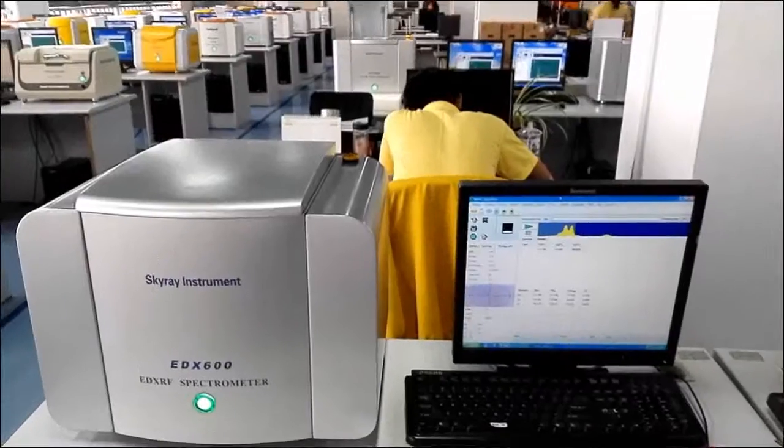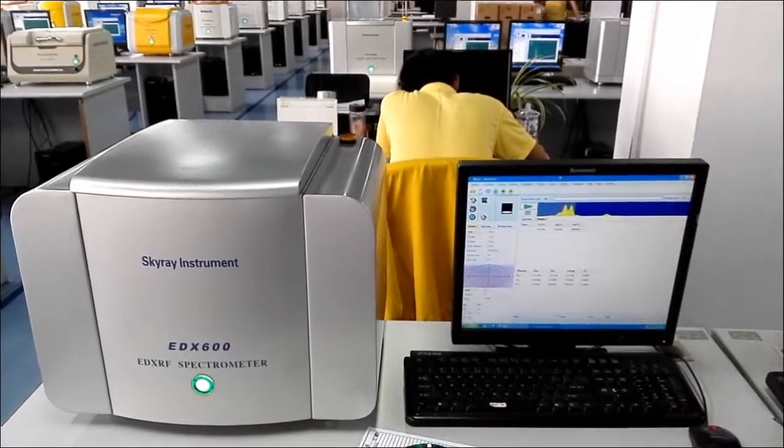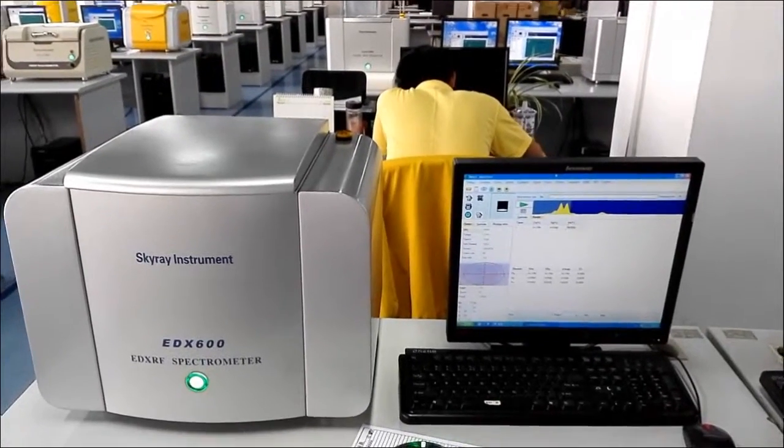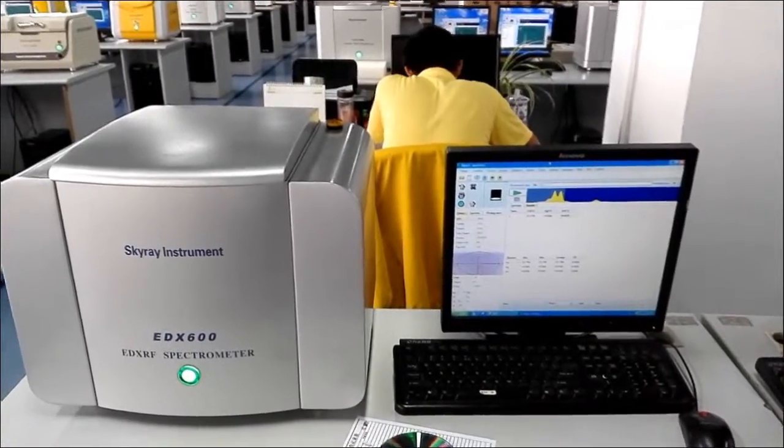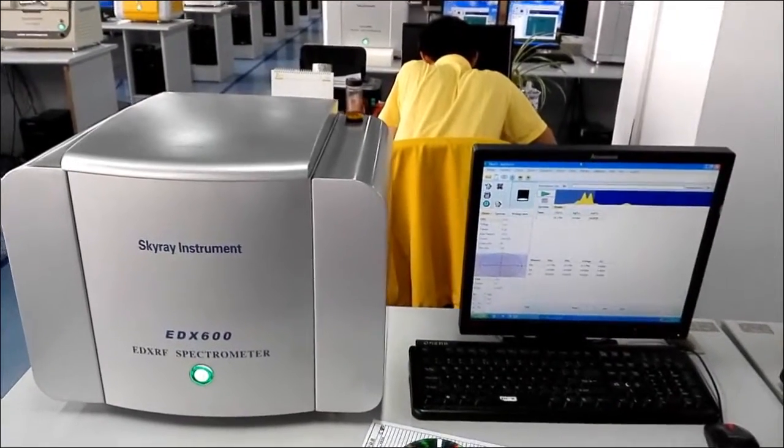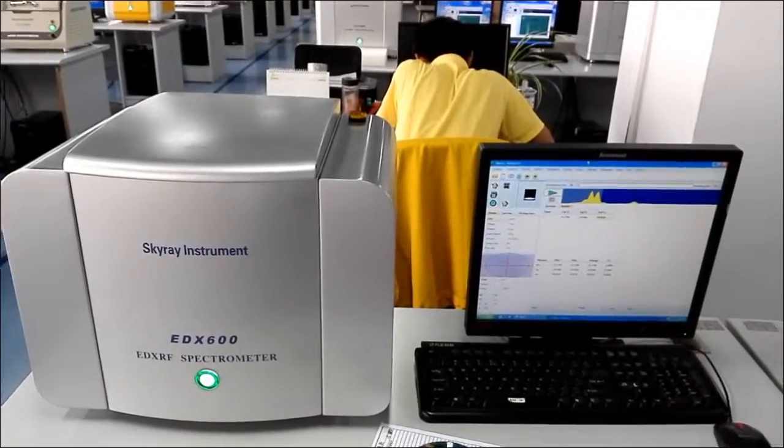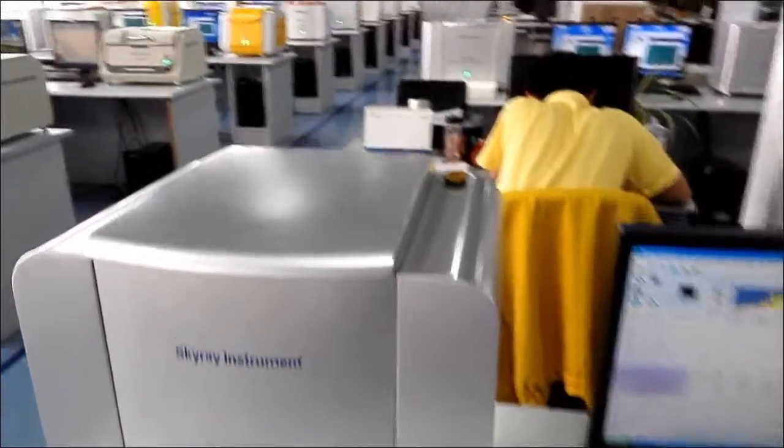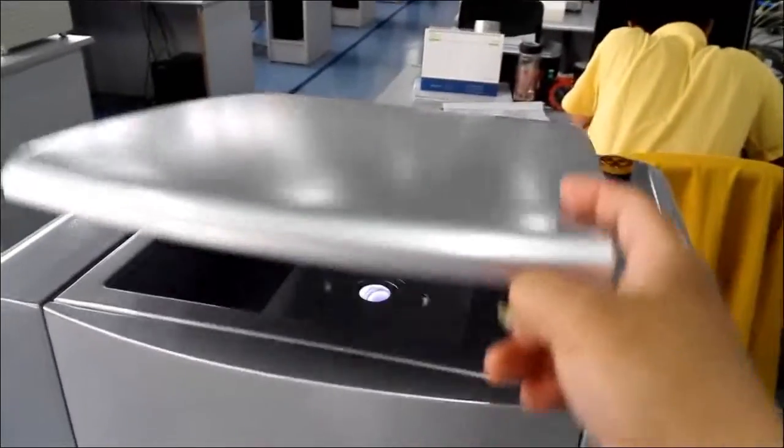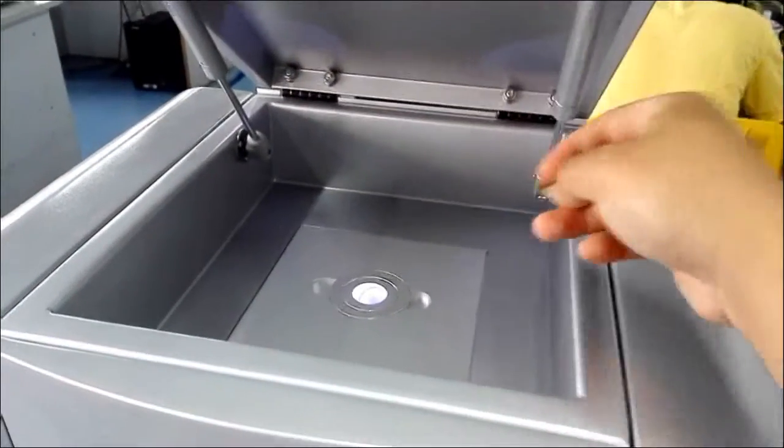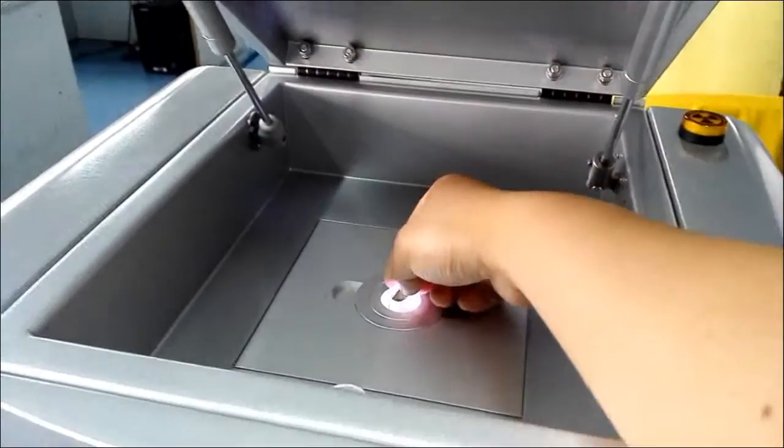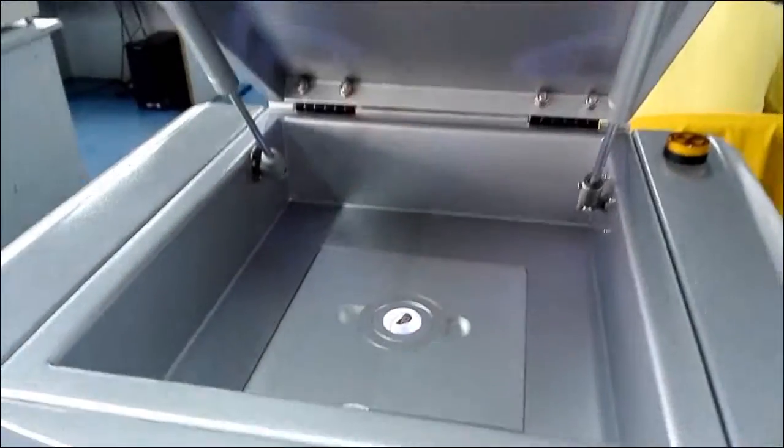This video is to show you how to use an EDX-600 to test your gold and get a reliable and accurate result. Open the lid and load the sample on the test window. Close it.